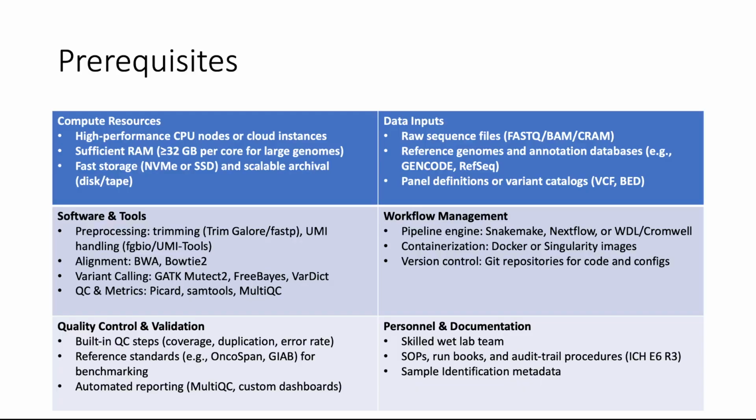And of course, we need to organize this process in a step-by-step pipeline, and in most of the cases it's being done with tools like Nextflow. Also, we can use containerization like Docker to use packages which have all the dependencies in a controlled and shareable package. It helps with version control and distribution of these packages in our environment.